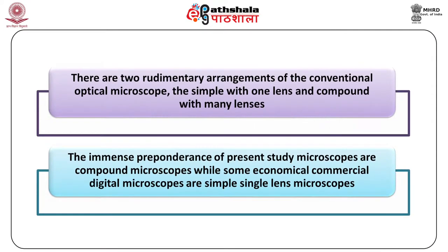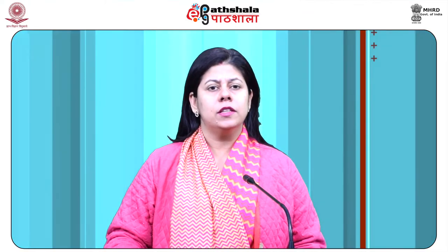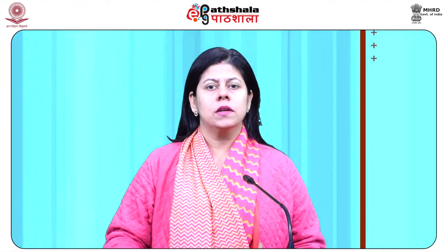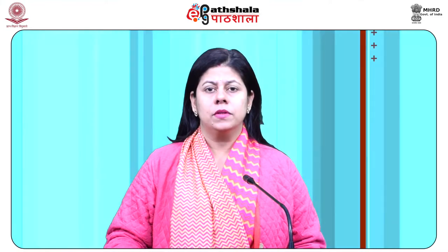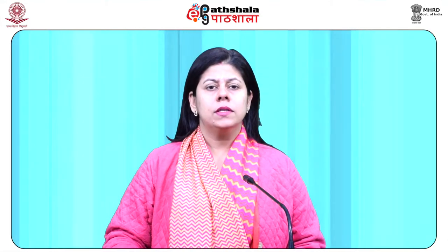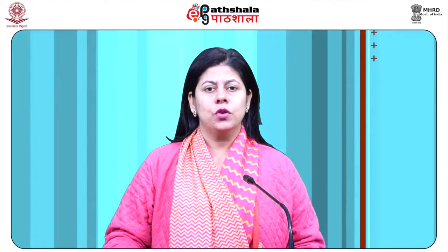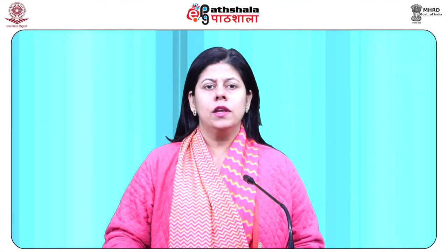There are two rudimentary arrangements of a conventional optical microscope, the simple with one lens and the compound with many lenses. The immense preponderance of present study microscopes are compound microscopes, while some economical commercial digital microscopes are simple single lens microscopes. Principally, a magnifying glass is a rudimentary single lens microscope. In general, microscope optics are stationary, set to concentrate at diverse focal depths. The lens to sample distance is adjusted, and to receive a wider or narrower field of view, a separate magnification of objective lenses should be applied. Most up-to-date research microscopes also have a separate set of optics for illuminating the sample.